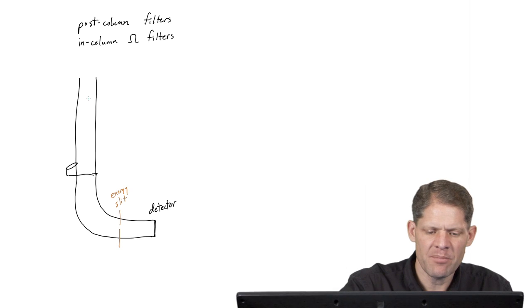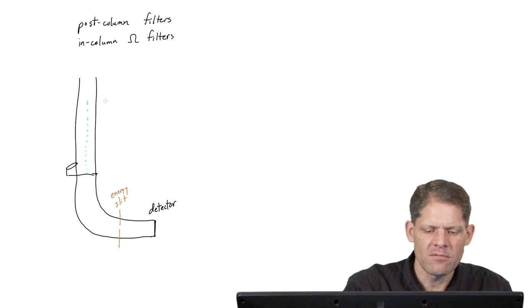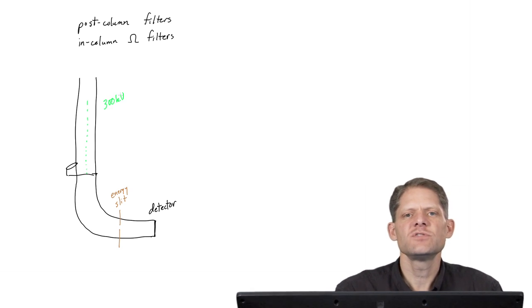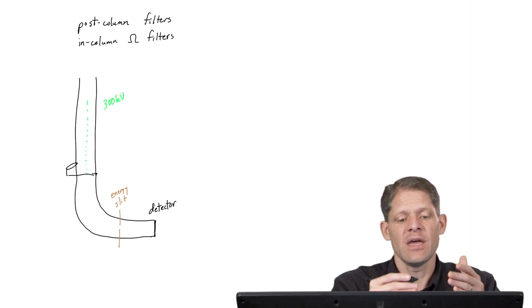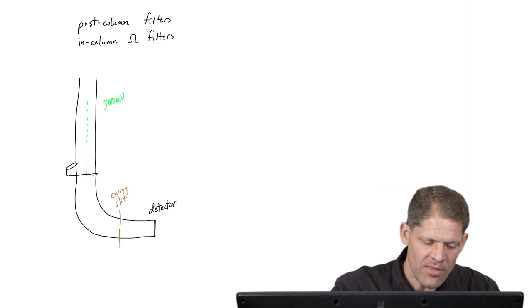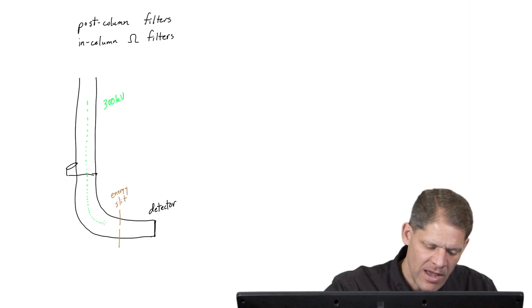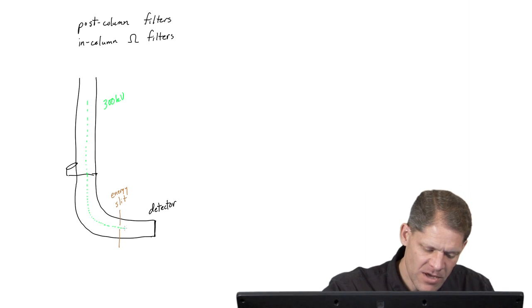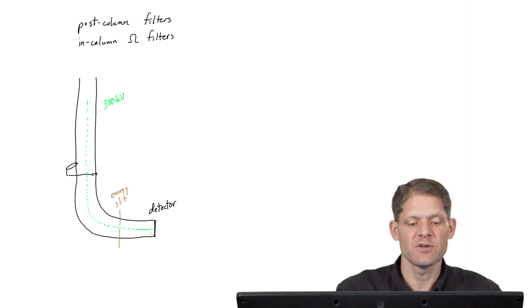And the principle in operation is that electrons that are coming down the column at, let's say, for example, 300 kilovolts, those that are either unscattered or elastically scattered emerge with the same energy, the full 300 kilovolts. And as they pass through this energy prism, they are bent and allowed to pass right through the energy slit, and they come and hit the detector and form the image.